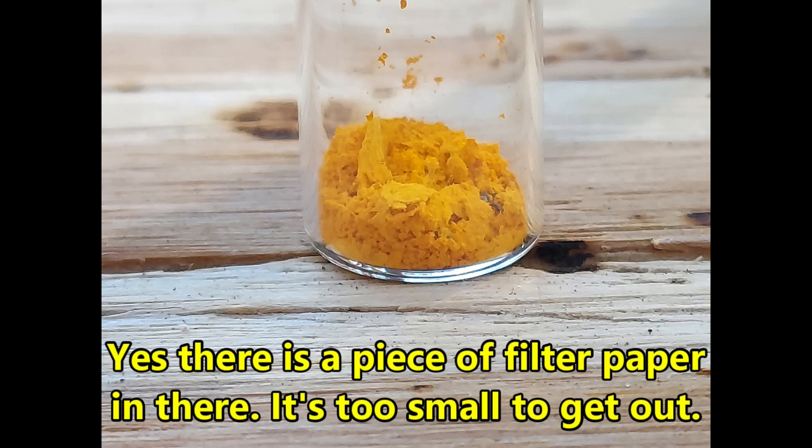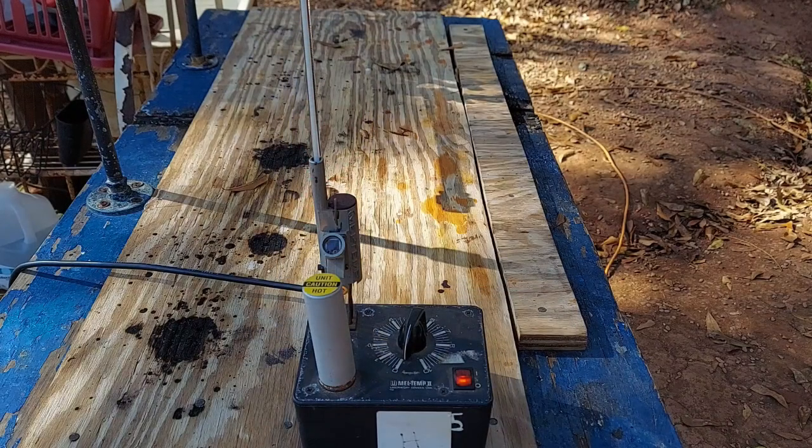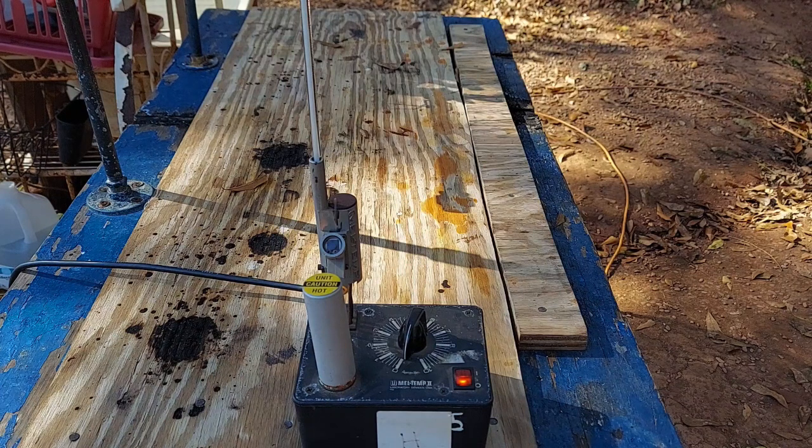I actually filmed this once before yesterday, but for some reason my reference dinitrophenylhydrazone decomposed — it turned black — before the expected melting point of benzaldehyde dinitrophenylhydrazone, which is 239 to 241°C. JR had mentioned maybe it should have been rinsed better, and he's probably right. The filter paper was extremely brittle from where the benzaldehyde standard sample had dried, but not at all from the experimental sample. One was perfectly intact and the other was like trying to pick up ashes — getting a sample scraped off was a real challenge.